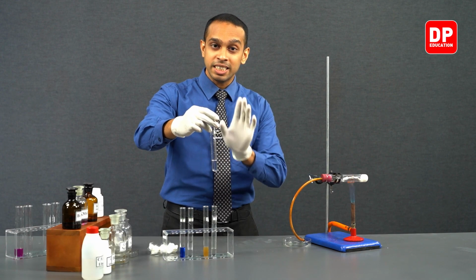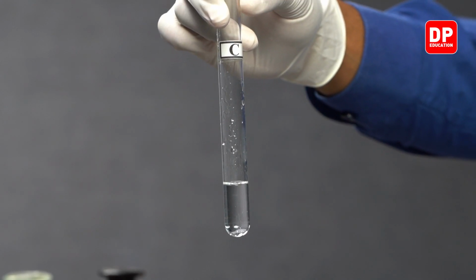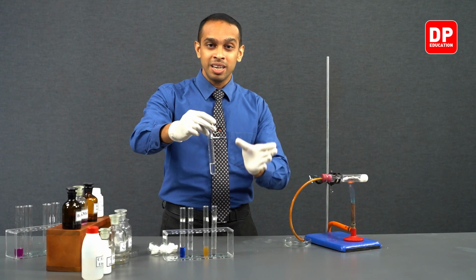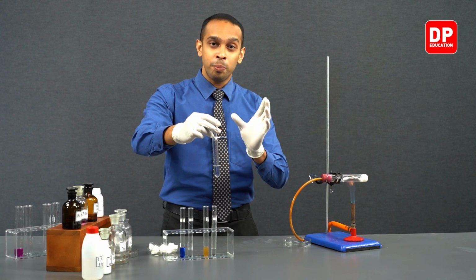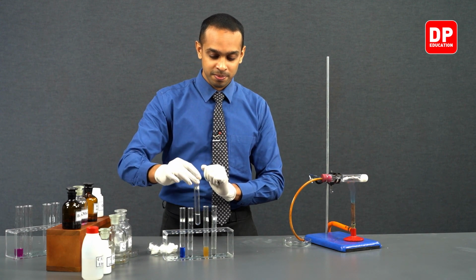So when we use acidified potassium permanganate, the observation is that the purple color of the acidified potassium permanganate completely turns colorless. This is due to potassium permanganate, or permanganate ions, turning into Mn2+.